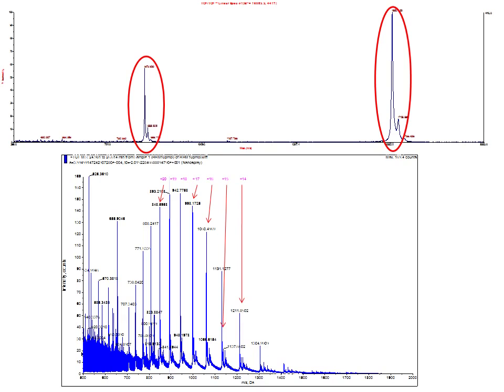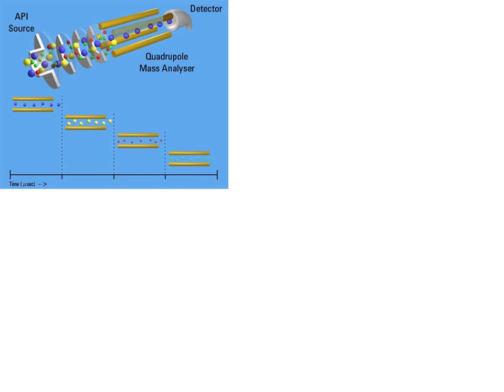The main advantage of using electrospray is that it can be interfaced with liquid chromatography more easily than MALDI, but we'll discuss this further when we have discussed chromatography in more detail. Electrospray is most often interfaced with quadrupole mass filters, although ion traps were very popular for a long time. We will discuss those briefly later.